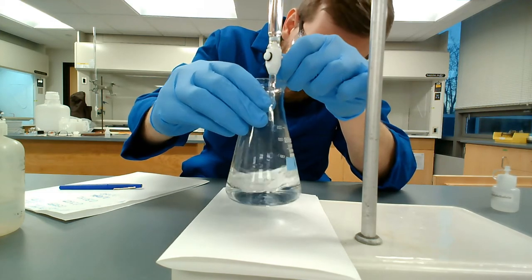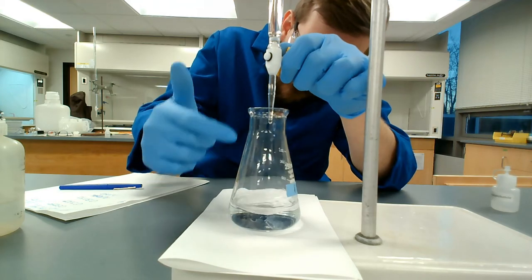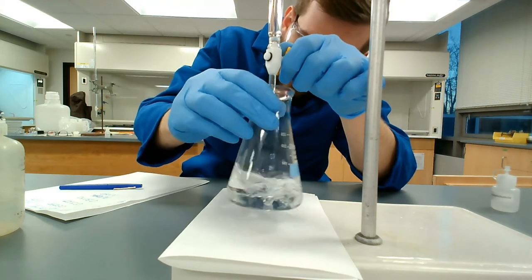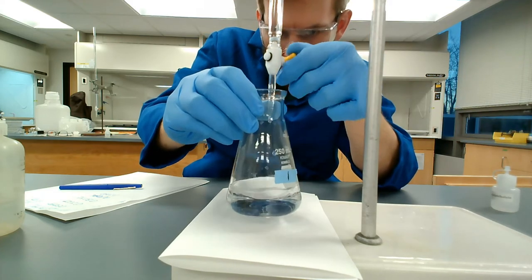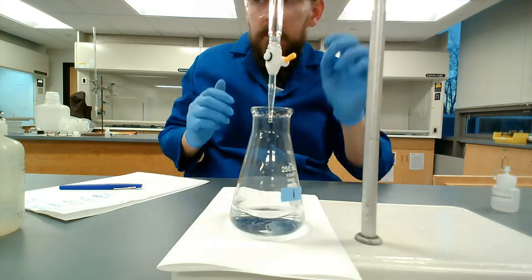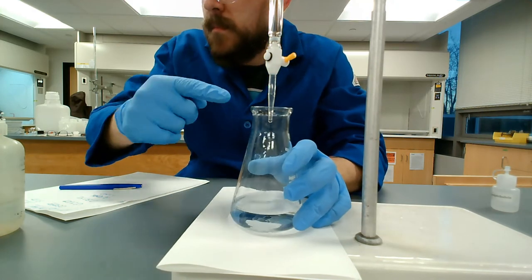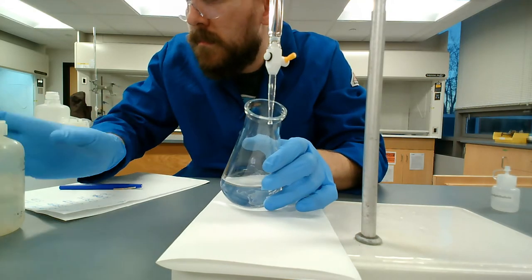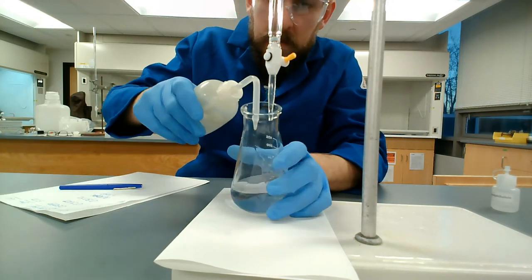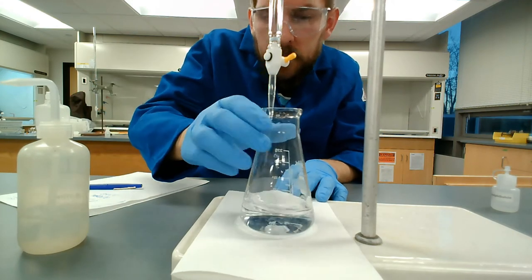So we started with an open stream. As I was swirling, I started going to two drops. Now I'm going to about a drop a second. I'm starting to see the pink persist as I'm doing this. That's indicating to me that I need to slow down. There is a bit on the tip of this burette that I have dispensed. I need to make sure that it is in the Erlenmeyer flask before I continue. So I tap it to the side of the glass, rinse the sides down, and give the flask a quick swirl.